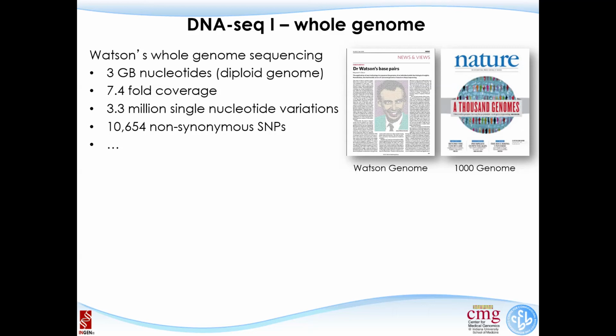No, because this technology is very accurate, but it still has a 0.1% chance of making a mistake. I mean, that is a lot of mistakes if we're talking about 3 billion letters. So what we need to do is have multiple measurements for each piece of the DNA, and then use that to figure out the DNA, the SNPs.